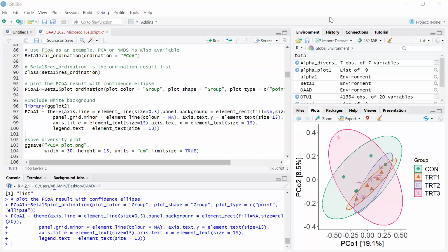We are talking about diversity here. Diversity meaning how the samples differ in composition of bacteria. Is it clear? So you are trying to say one is more diverse. Yes, that's the point. When it is bigger, it means the samples are far away from each other.